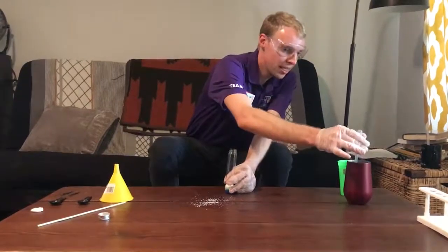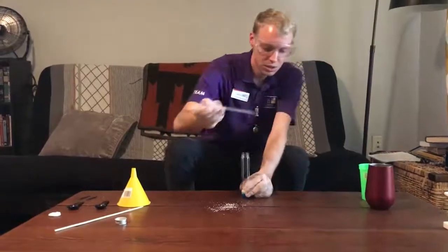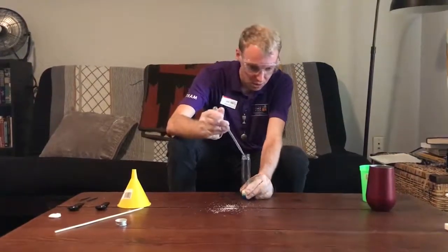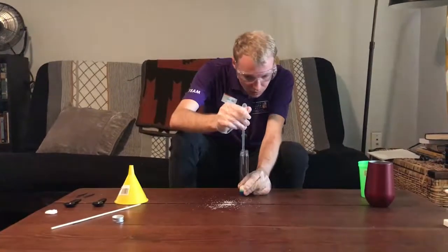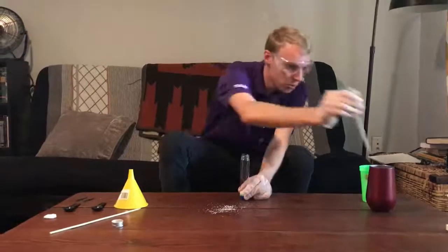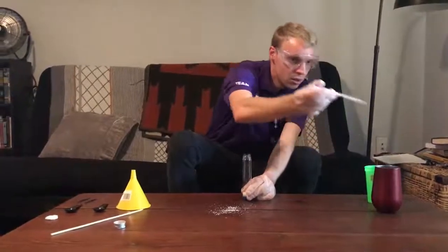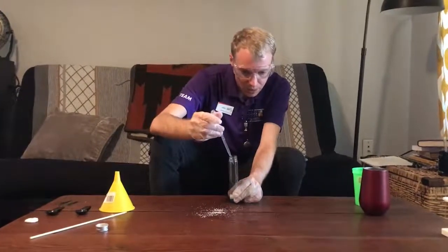of putting just a thin layer of water, just enough to fully cover the sodium chloride. And it looks like I need just a little bit more. Should be good.